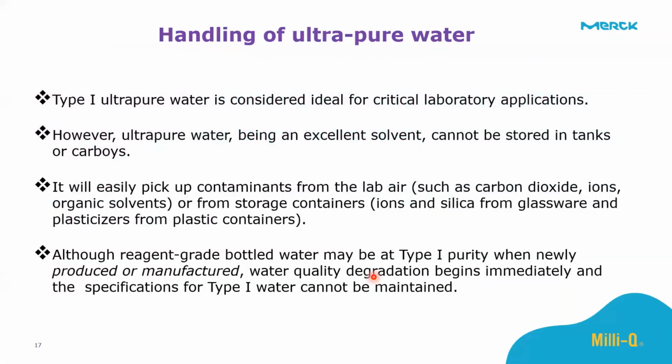And just to mention that ultrapure water should not be stored, because, as we mentioned, its application is for critical analysis. So we talked about chromatography, that is liquid chromatography, gas chromatography, elemental analysis, molecular biology. So it's for critical laboratory applications. And water being an excellent solvent, it means that ultrapure water should not be stored. It should be freshly prepared and used almost immediately, because it will pick up contaminants from the laboratory.